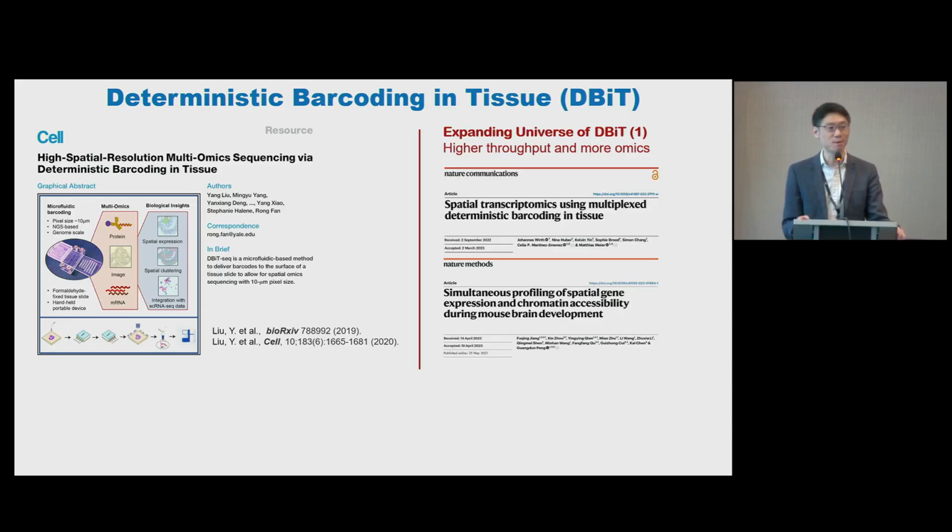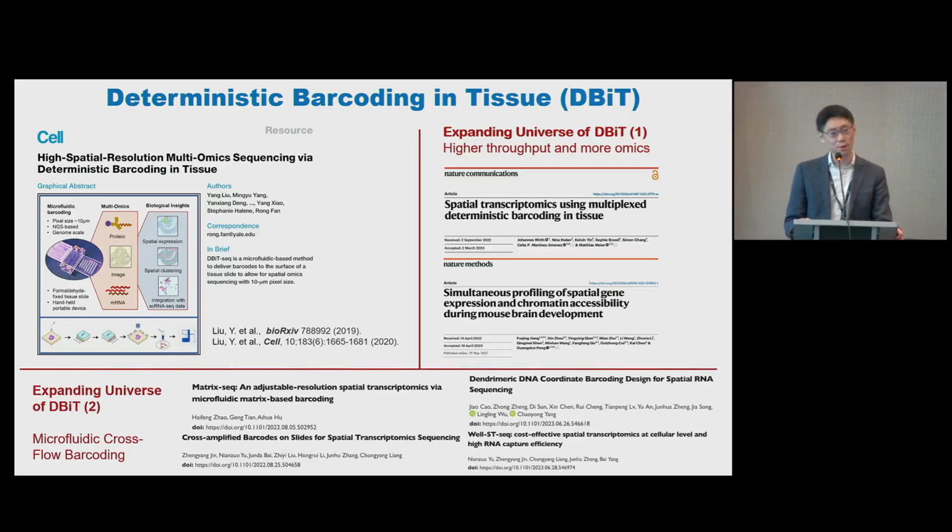So now we are using their protocol. They can get a much higher gene count and UMI count. But also, in every experiment, they were able to map out 9 tissue sections simultaneously by redesigning the whole microfluidic network. And a couple of other groups tweaked our microfluidic delivery system to create a custom-designed DNA microarray, and you can have whatever microarray spot size you want, just using the microfluidic device, the microchannel, to define it. We tested this as well. Potentially, this can give you a size down to even 2 micrometers.